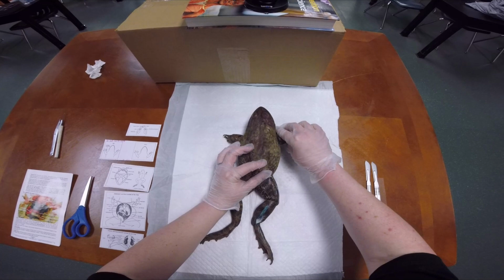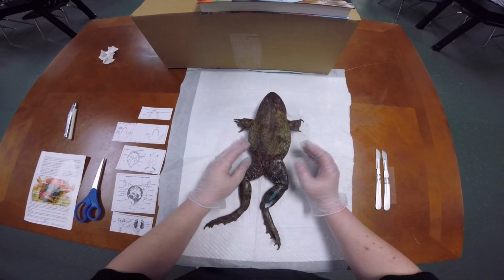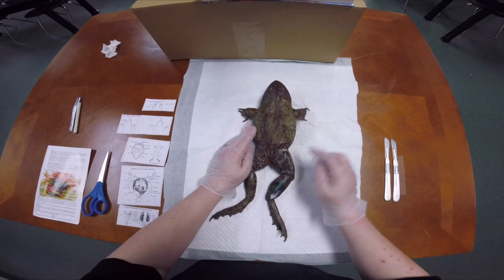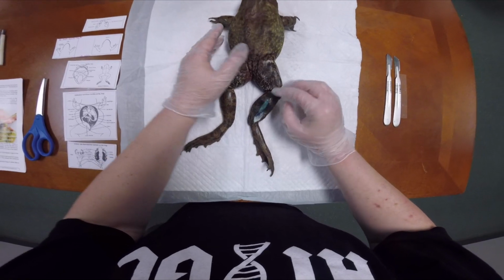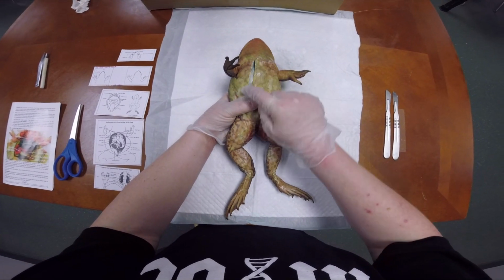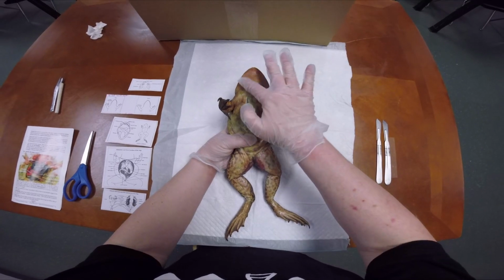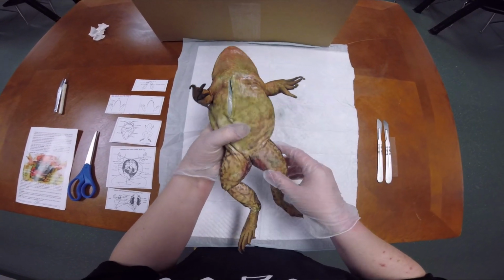So this is the bullfrog dissection. So we have our bullfrog here. What you're going to notice is things like this. So these bullfrogs have been injected with dye, red and blue. So you're going to be able to see this incision that was made already for the dye. And then this reddish tint up here isn't how they normally look.